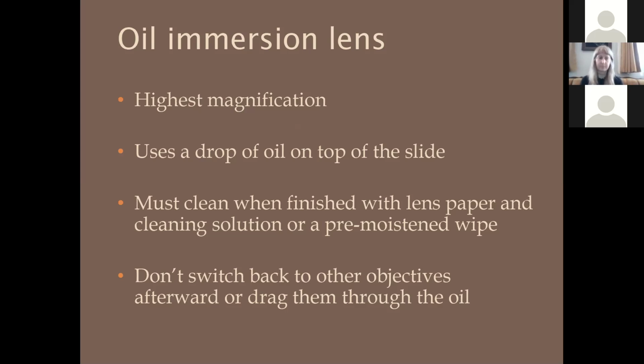Some places are getting better and have other things that are that cheap. I don't know of other brands that are doing it that cheap offhand. Swift is another company that makes really good ones that are pretty cheap. If you're willing to spend more money than that, you can get better quality objectives that are going to give you a crisper picture. But the Amscope that I have is just fine for doing everything that I have needed it to do. So I haven't needed to spend more money than that.